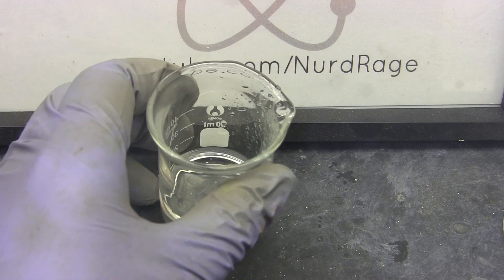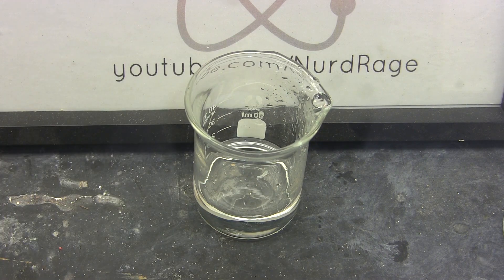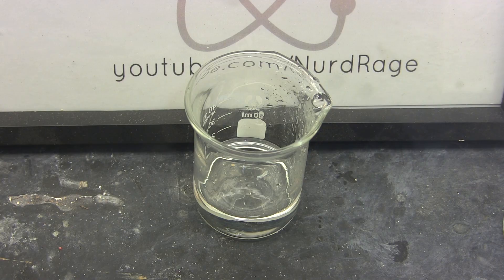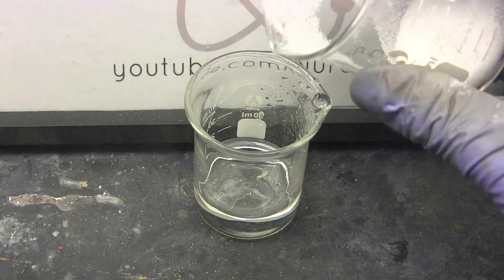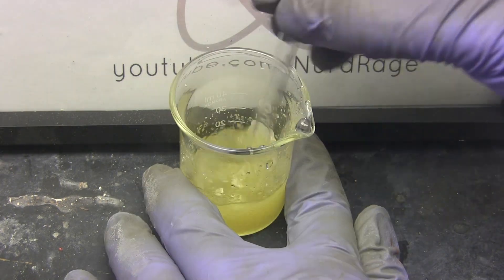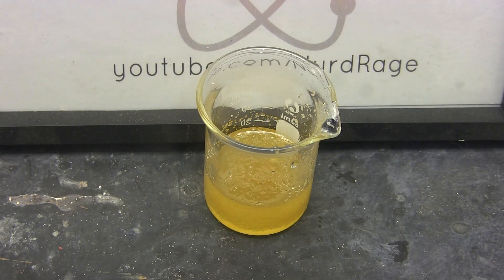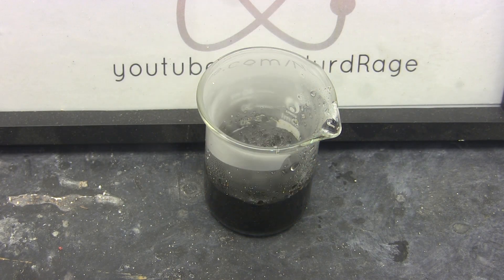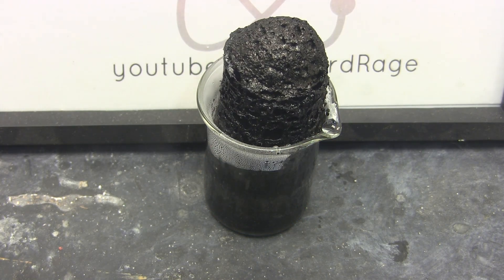And there we have it, it took a lot of work but we made sulfuric acid from sulfur and water using hydrobromic acid as the catalyst. To test the acid I'm going to use an equal volume of sugar to run the famous carbon pillar experiment. The production of carbon confirms that we have a strong concentration of acid.